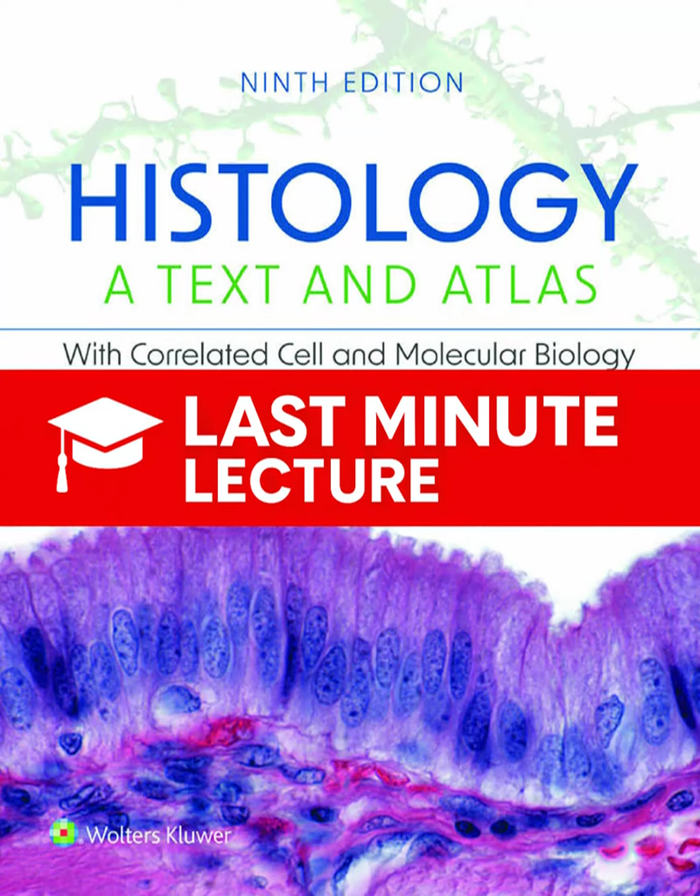And if you repeat the process with what's called iterative expansion microscopy, or iExM, you can get up to 20 times linear expansion, giving you resolutions around 25 nanometers, which truly starts to rival a traditional electron microscope. The sources mention the implication for diagnostics with something called expansion pathology, or ExPath. This seems massive. It is completely transformative. ExPath is about applying these protocols to routine clinical H&E slides.